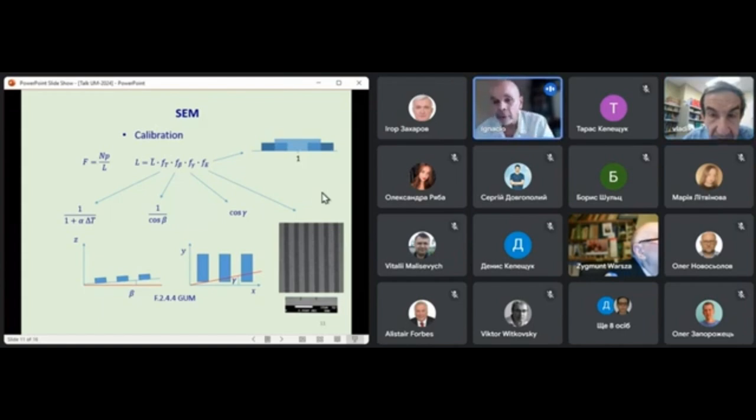Oh yes. You can use other distributions, of course, but as always in evaluating the uncertainty of measurement, you have to use some assumptions, and the results will, of course, vary according to the assumptions you made. In this case, they will vary according to whether you use rectangular distributions, uniform distributions, or other distributions like the normal, which would be perfectly reasonable, but you have to be prepared to explain how reasonable your assumptions are.